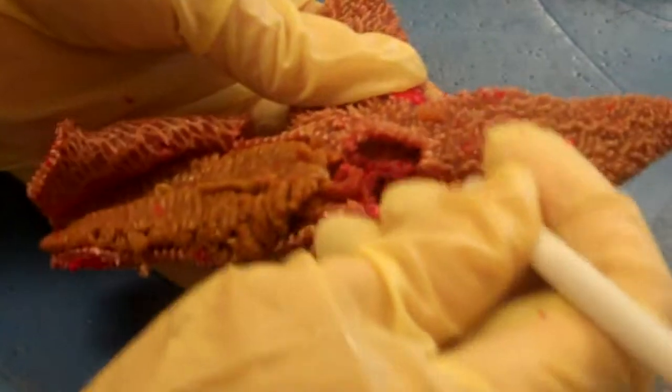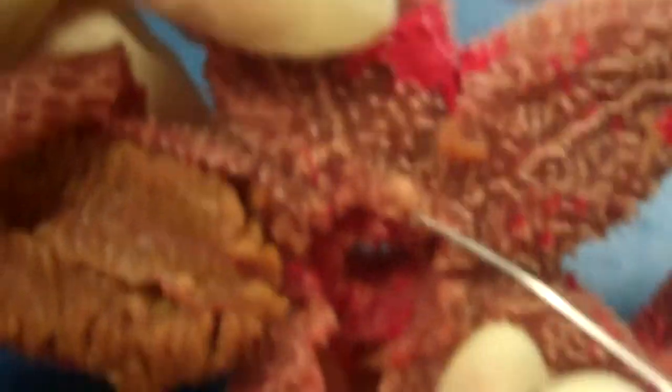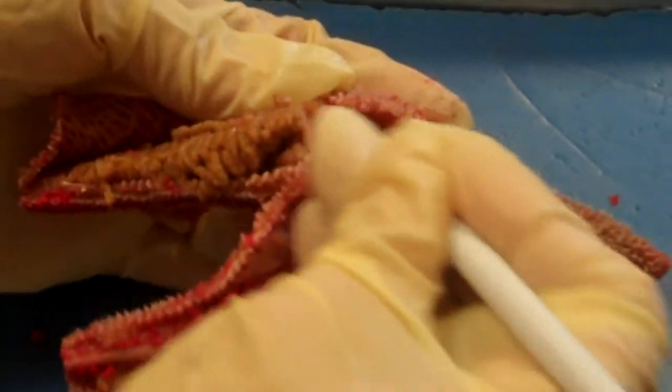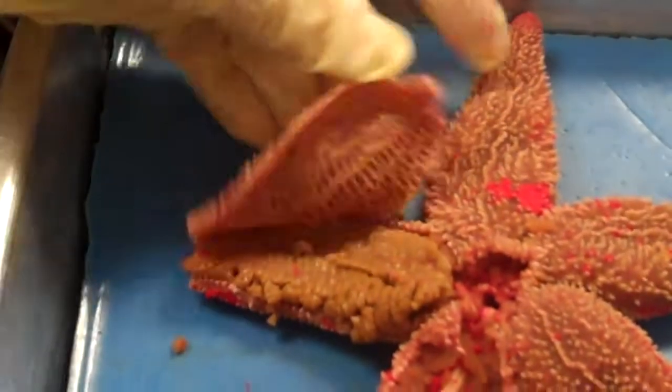In the center here, we removed the stomachs so you can see the ring canal. There's a bony ring just above the mouth. This part here is the madriporite — that's the opening to the water vascular system, which leads down to the ring canal via a short tube. Also in the skin, the white things here are the ossicles embedded in the skin, serving as the skeletal system for the sea star.